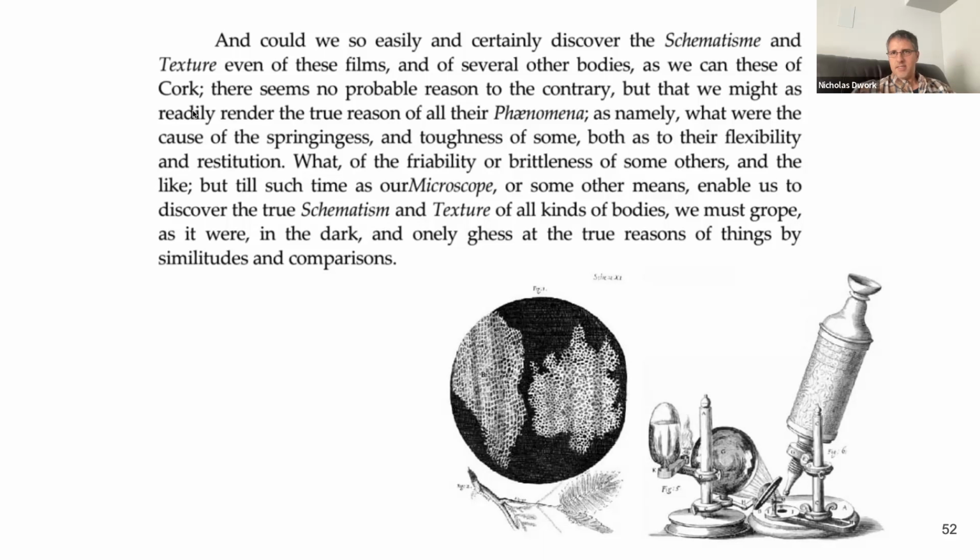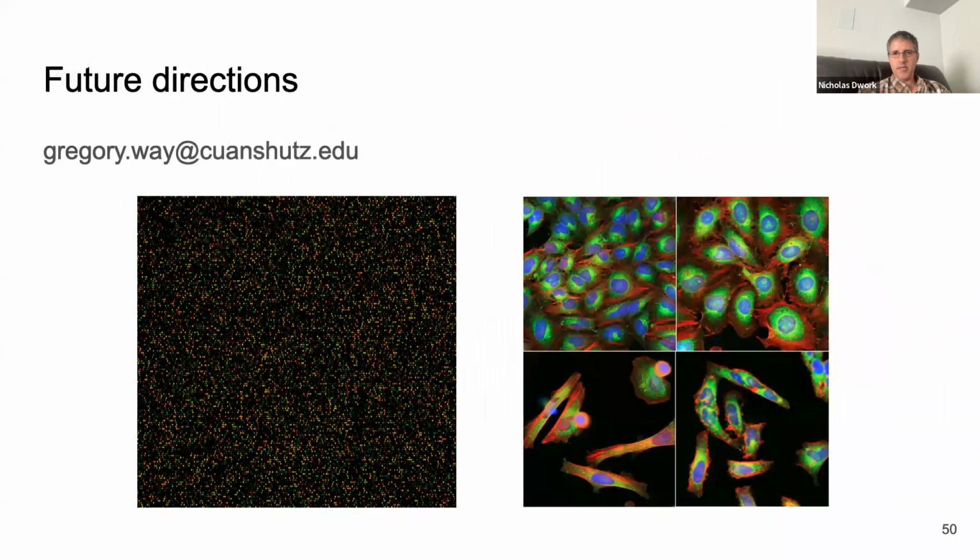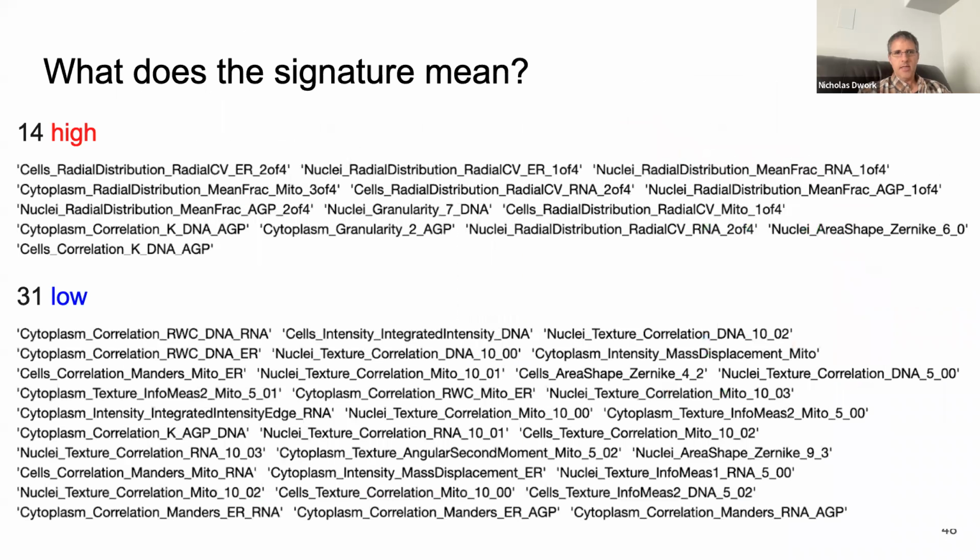I have a question. Great. If you go back a couple of slides, the features that you were using in your analysis just then, these are from what software? CellProfiler. And were those features not selected by hand? What do you mean selected by hand? How does CellProfiler work, is what I'm asking. How does it get features? What were those features and how were they created?